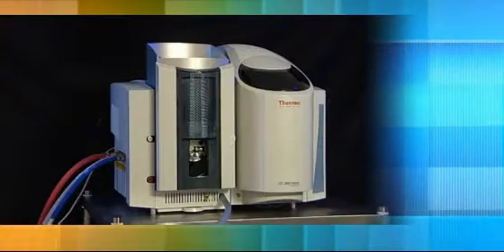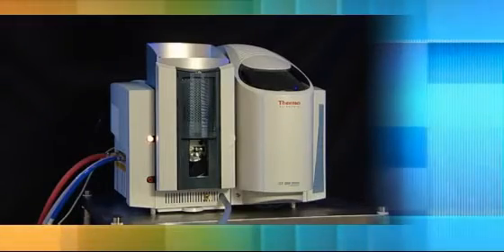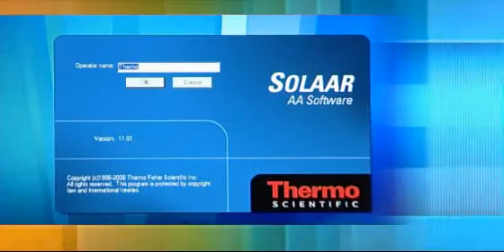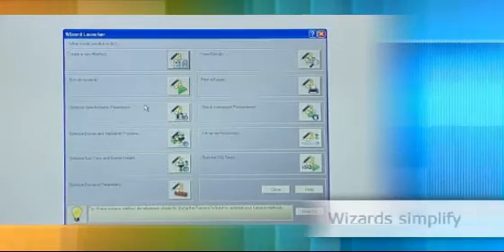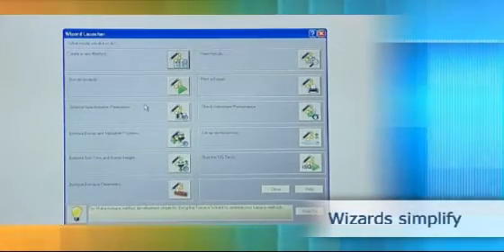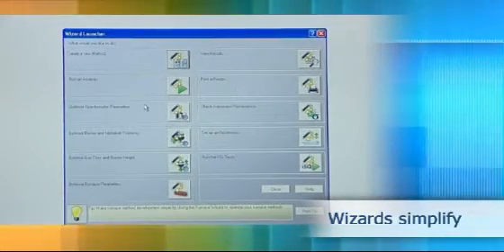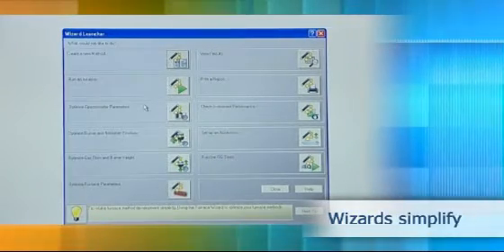Thermoscientific ICE 3000 series AA spectrometers are operated with SOLAR software which provides a range of wizards to make routine tasks simple and efficient.